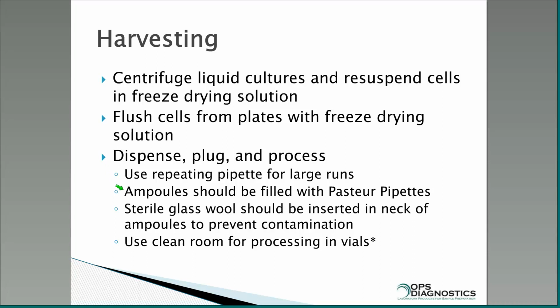As I mentioned, with ampoules for filling them, sterile Pasteur pipettes are critical for getting the solution way down into the bottom of the ampoule. Sterile glass wool in the neck of the ampoules is recommended. And as I said, for sterility concerns, especially with shelf dryers, a clean room is oftentimes warranted. We have a whole bank of hoods, what are known as aseptic filling hoods, and those can be used pretty nicely as well. You can move the freeze dryer right up to them if you need to.